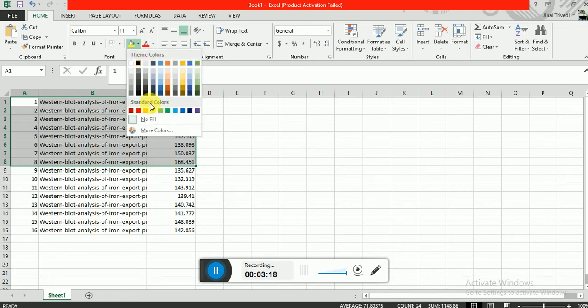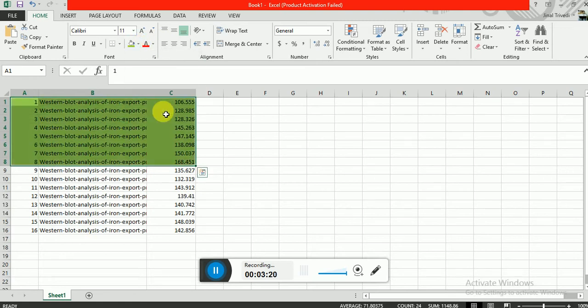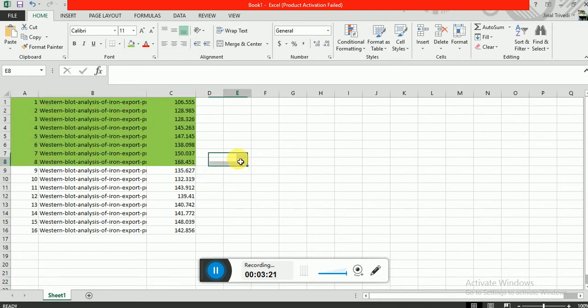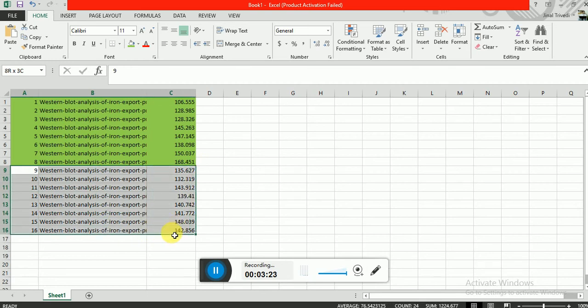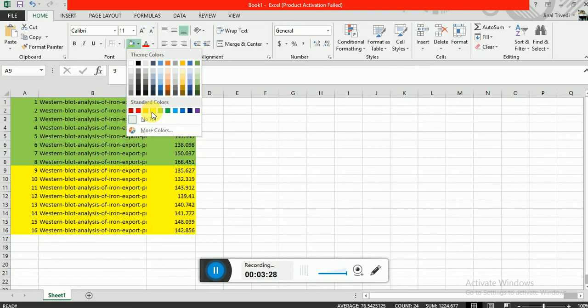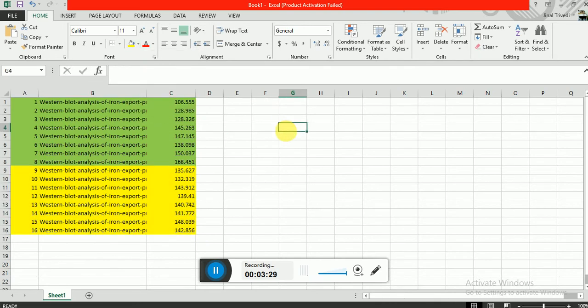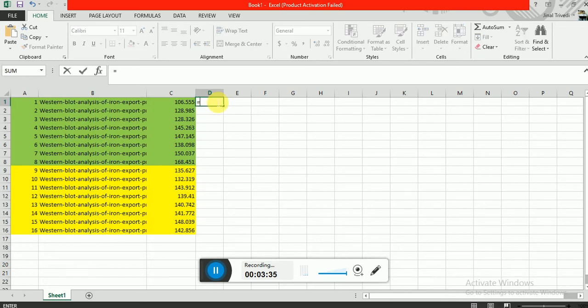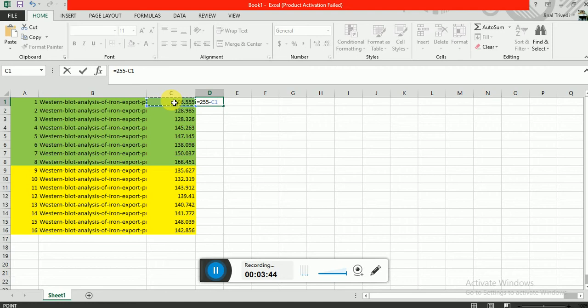Now first do normalization. For that we have to just minus your median value with background value which is called 255. It is the data intensity of white background, so you have to minus this.